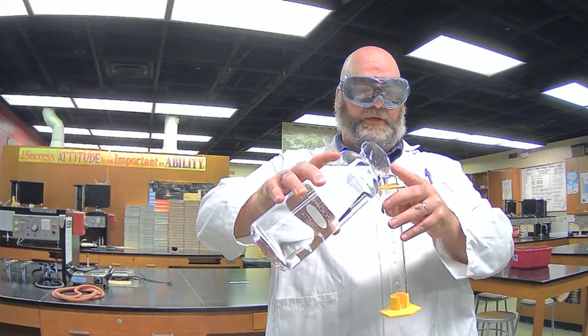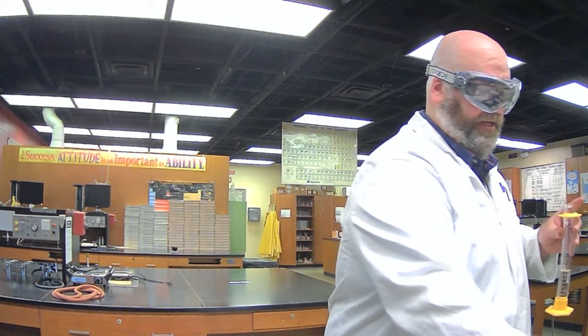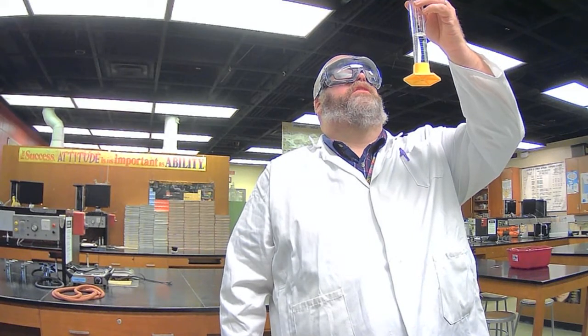You're going to write down or type into your data table that you're creating in Canvas 21.04 grams. Now we want to get the volume of those same 4 marbles. So I'm going to get an initial volume of water, and it really doesn't matter how much you start with. You just need enough to cover the marbles and not so much that you go past the 100 milliliter mark. I'm reading the bottom of the meniscus here.